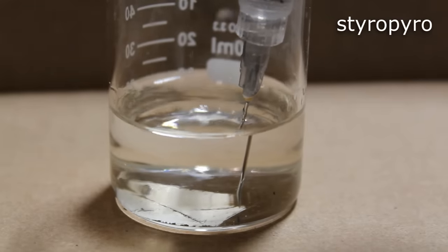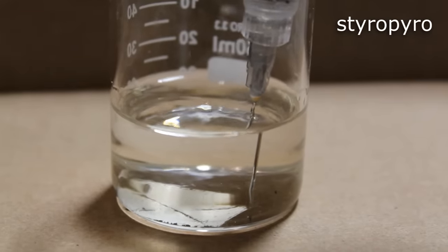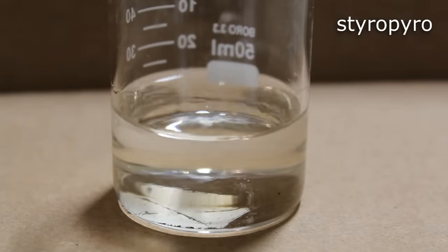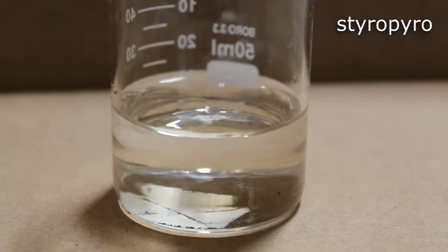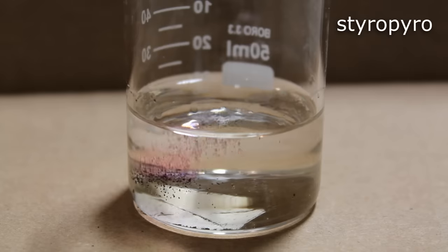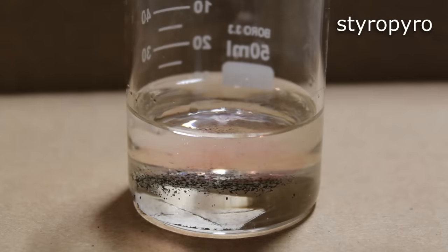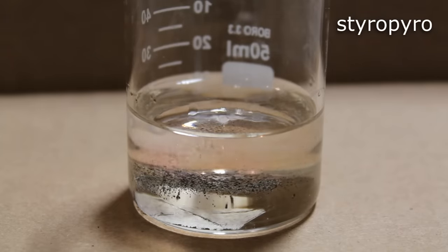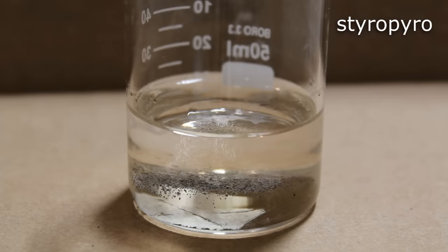Another demo that utilizes manganese heptoxide is the classic thunderstorm in a beaker. I actually first saw this done by NerdRage here on YouTube. Basically, a layer of concentrated sulfuric acid is injected under some ethanol, and then some potassium permanganate is sprinkled on top. Then that permanganate sinks down to the boundary layer and reacts with sulfuric acid to make some manganese heptoxide, and then that reacts violently with the ethanol, giving a display of pretty lights that you see here.